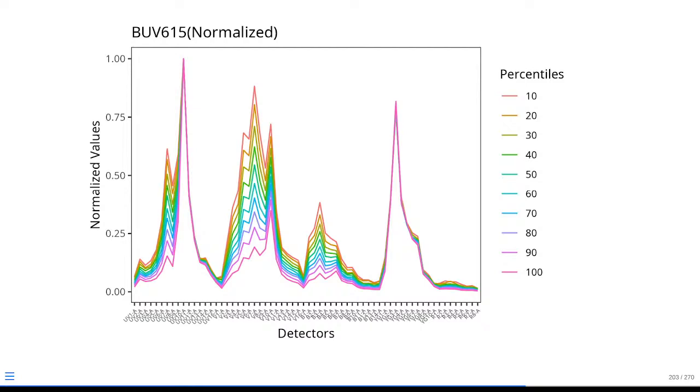But then we noticed, even though we were following best practices as far as the application of our positive gates, and we thought that, yeah, this looks like a good gate for cell controls, when we actually looked at the same kind of approach, we could see that no matter how we drew the gate, even if we were drawing at the peak and then over, we had a significant amount of residual autofluorescence creeping into the signature, increasing the similarity to other fluorophores that were similar to autofluorescence and causing a bunch of unmixing issues. This in turn ultimately was fixed when we switched from these cell controls to bead controls to avoid having accidental little bits of autofluorescence end up in those signatures and cause issues across the board.